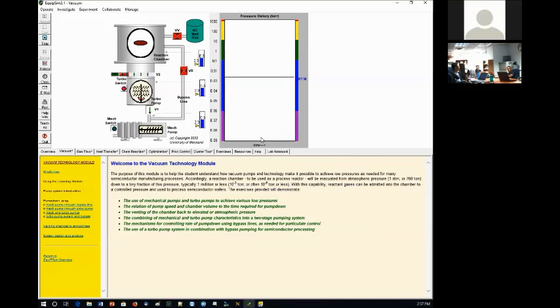You never pump down the chamber just to save a little bit of time over the reaction chamber over the turbo pump. You never do that. You never try to do it over high conductivity, in other words, larger lines. The main reason is this is a very quick change of pressure. Okay, so this creates a very abrupt change of pressure.